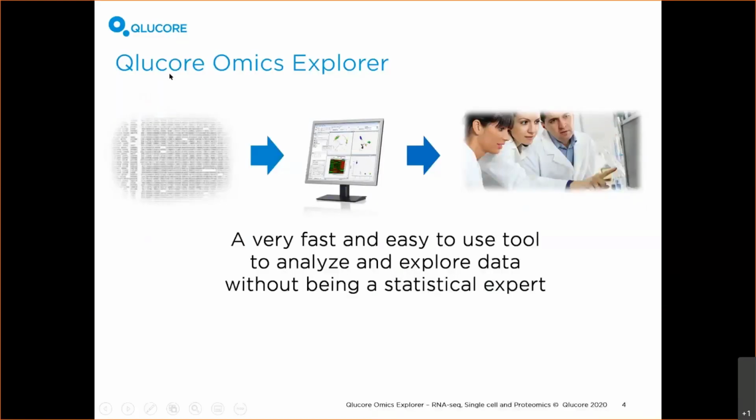Qlucore Omics Explorer, as I guess most of you know, is a very fast and easy to use tool to analyze and explore data without being a statistical expert. That being said, we also have statistical experts using this software, but the majority of our users are bench scientists and medical doctors.